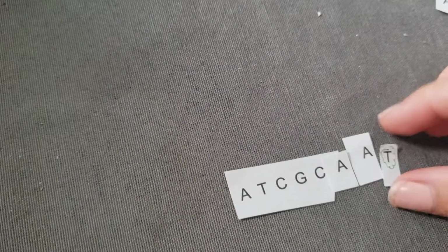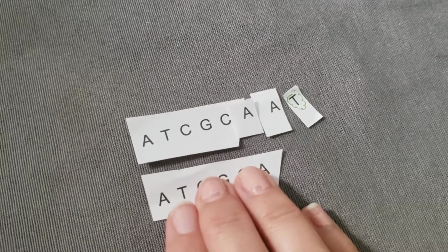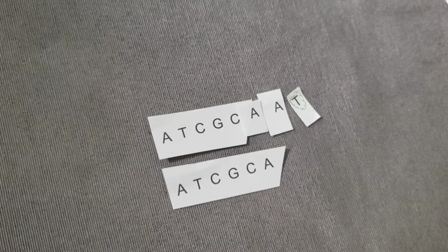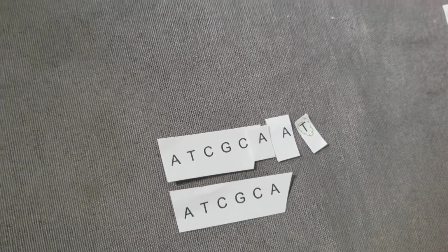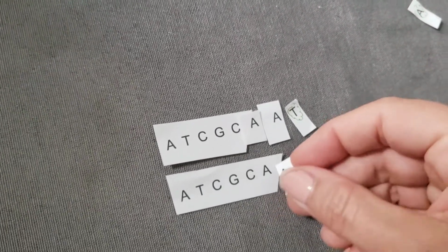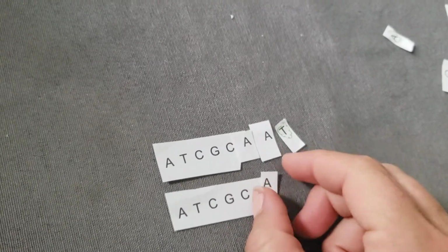And then we had a letter T that was fluorescent. The first strand that I built in this video had the primer, and then it had two A's. Oops, this is difficult. These little pieces want to stick.